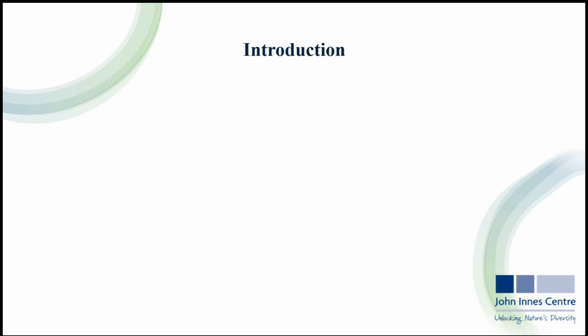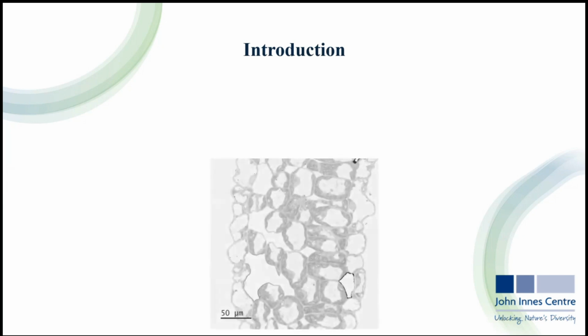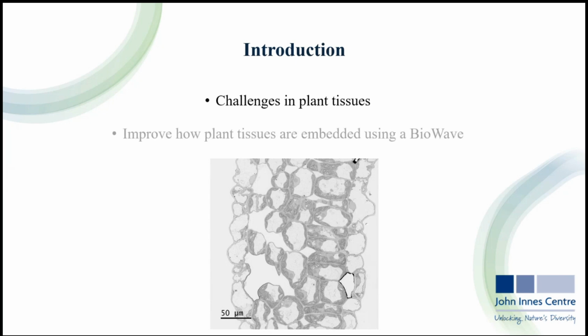Volume EM is a powerful tool for studying intricate structures of cells. However, preparing plant tissues for volume EM presents its unique challenges. Our goal with this research was to improve how we embed plant samples using a microwave tissue processor called the BioWave, and this significantly speeds up preparation time. But first, let's look at some of the challenges specific to plant tissues.